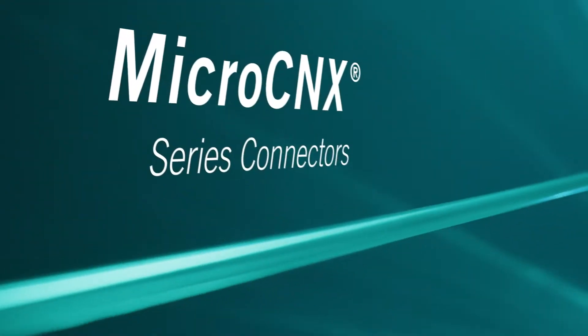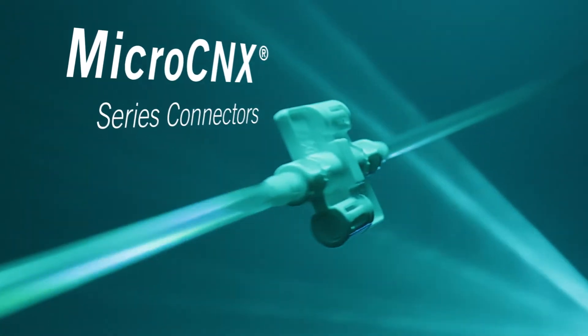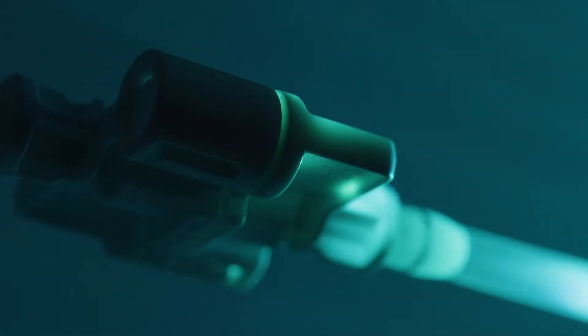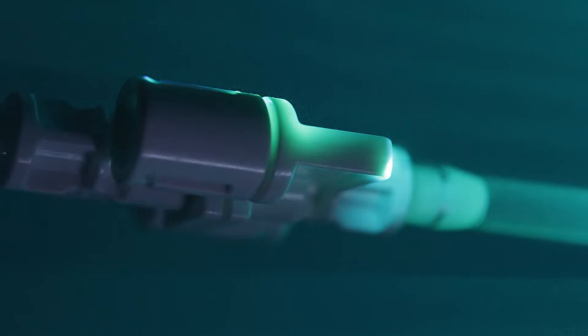Introducing MicroConnect Series Connectors — the small, aseptic, single-use connectors and the most efficient alternative to tube welding. This revolutionary MicroConnect connector is designed to make quick, seamless connections for a simplified process.